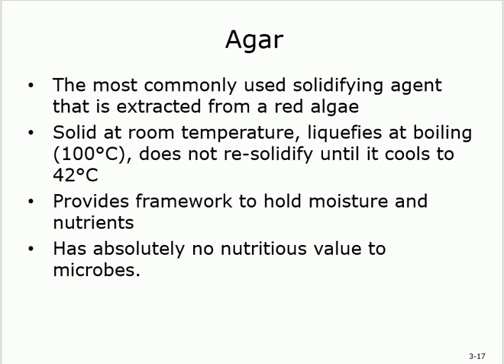So what's the importance of that agar? It provides a framework to hold the moisture and the nutrients. So the moisture will stay, whatever the status is, semi-solid or solid, it's not going to change. Okay? You're not losing the water, for example, of that medium. So it acts like a framework, like you're putting a cover on something, so the water does not evaporate. Hold the moisture and the nutrients, so the nutrients are not going anywhere. But it does not have nutritional value at all.